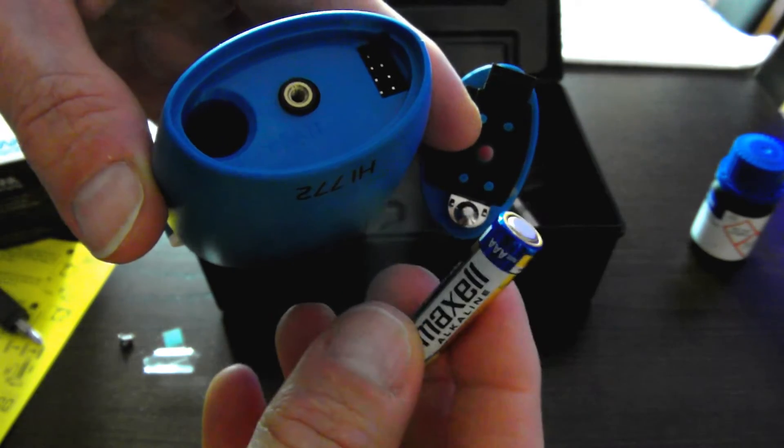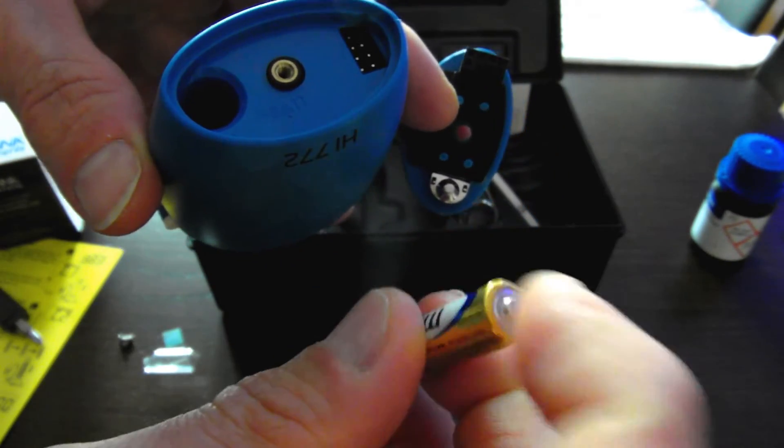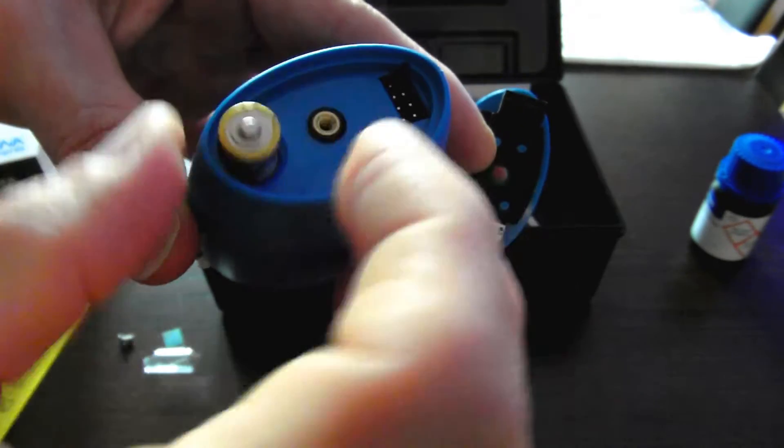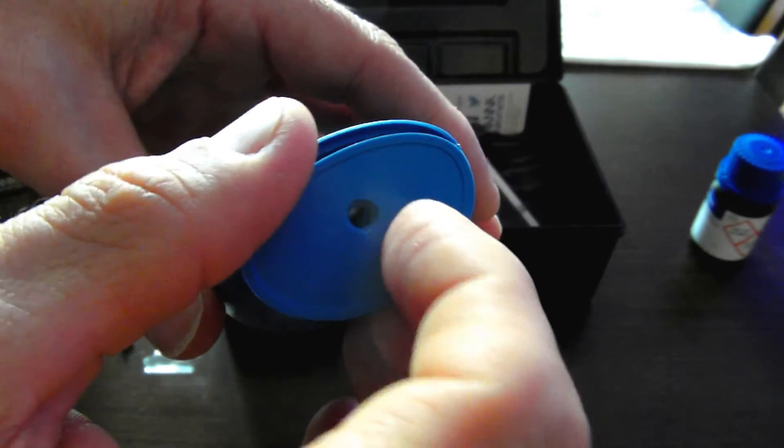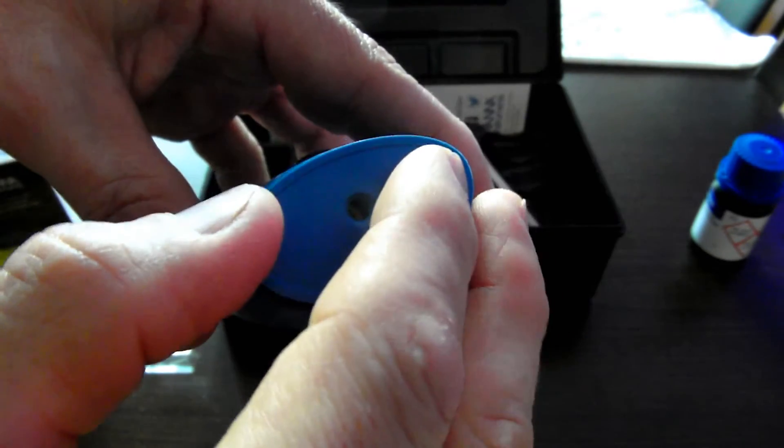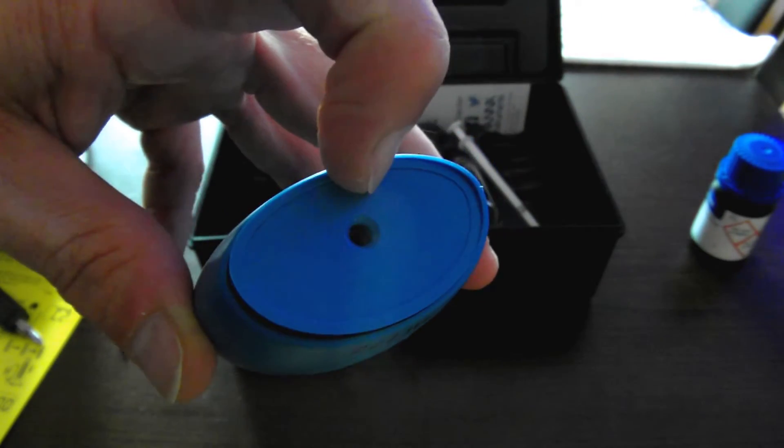Now, with the supplied triple A battery, there's a little symbol here for positive, so the positive terminal with a little nub facing outward. And then I'm going to reseat the base carefully and screw it in with the Phillips screw.